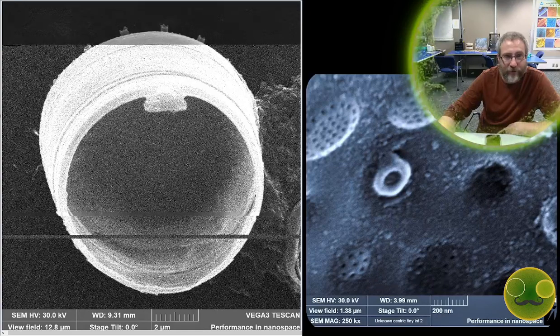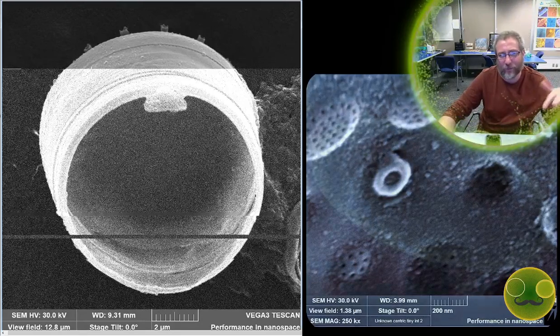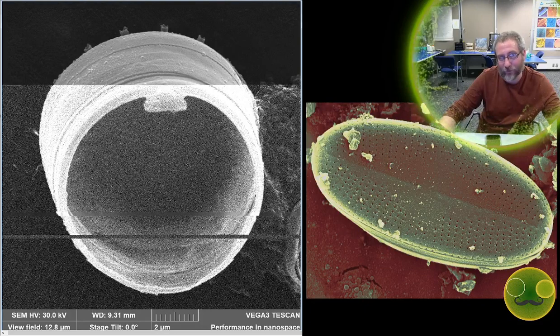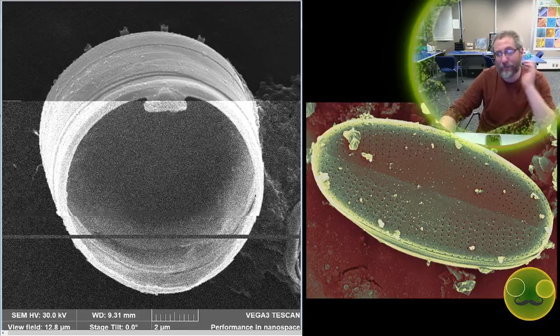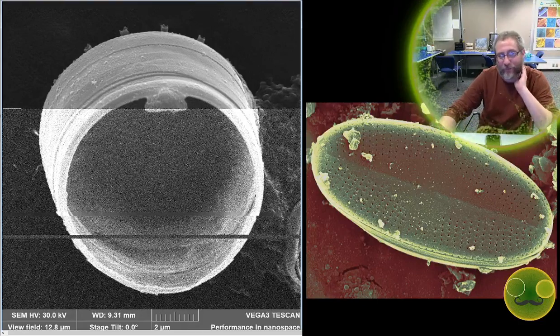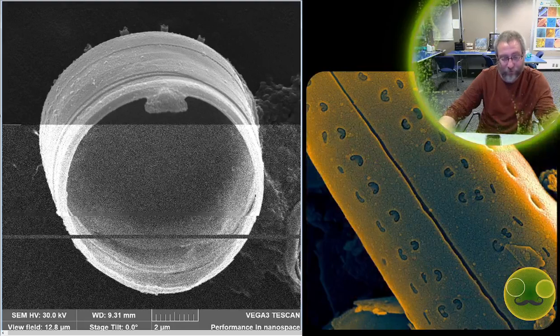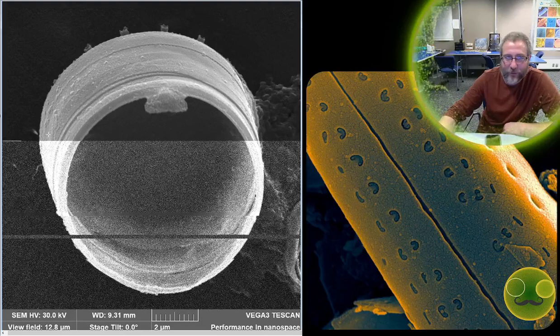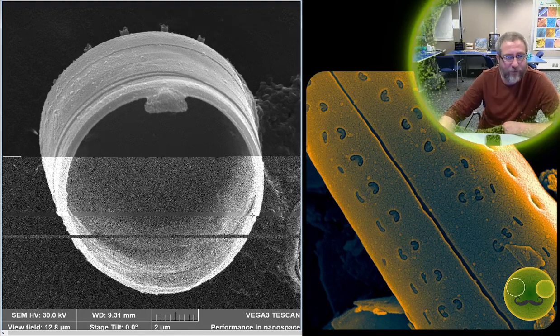I'm doing a little bit of adjustment to the light settings right now. The scanning electron microscope is actually pretty good at getting the brightness and the contrast balanced, which is like a photography skill set, something that I normally would do manually. But what I do is just let it figure out what it thinks is a good choice, and as long as I think it's acceptable enough, then I will usually do some editing in Photoshop or Adobe Lightroom later to fix the brightness and contrast so that it's perfect for publication or for just distributing the image. But I think this is fine.